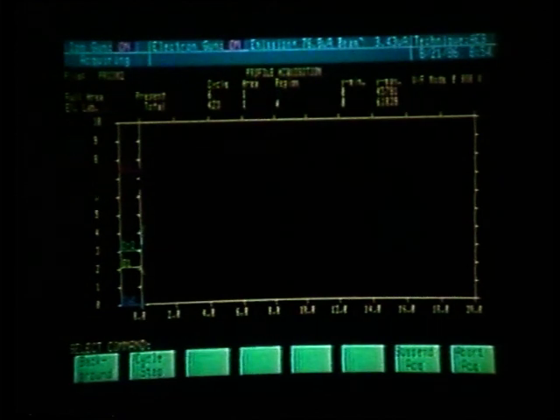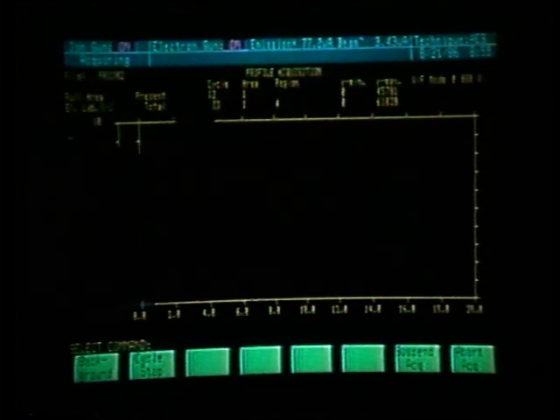Now you can see that every time the color moves for the carbon or chromium or oxygen, those are all data points. Maybe what would be more informative is looking at what cycle we are on.